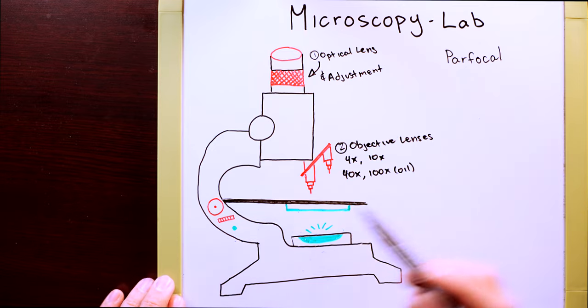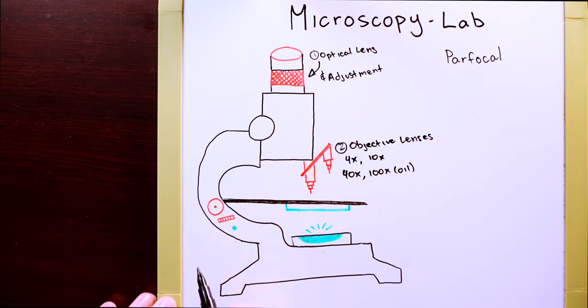Moving over to the side here, we have our coarse, the outer circle, as well as our fine adjustment, the inner circle.